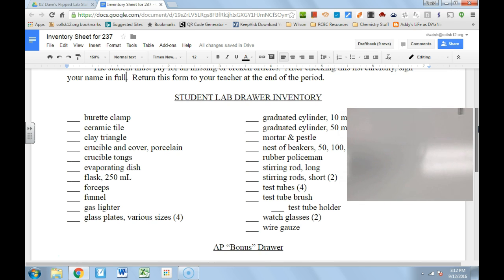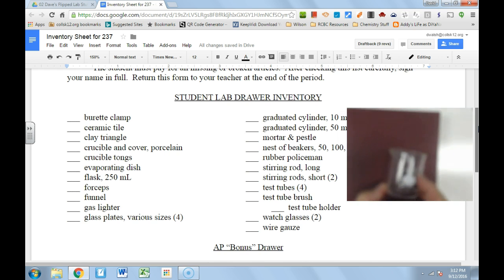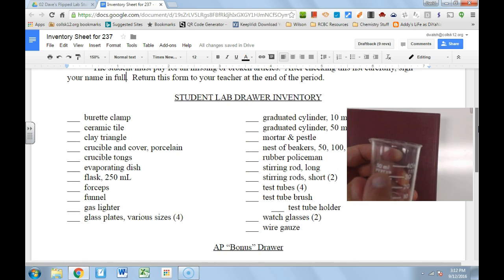And then there's a whole bunch of beakers. Much like the flask, there are graduations on them. This is the 50 milliliter beaker — it says so right here — but it's only graduated to 40, because 50 is beyond 40. There are varying sizes of this bucket-looking container.